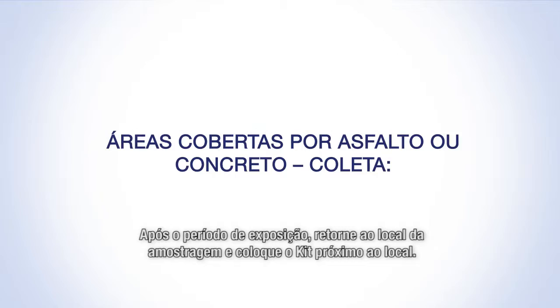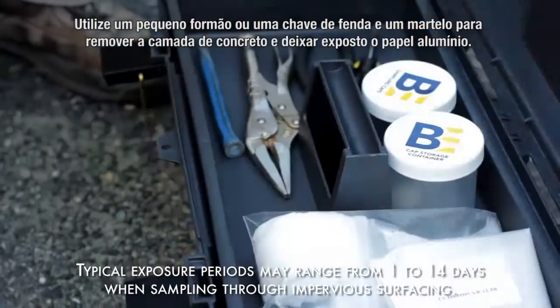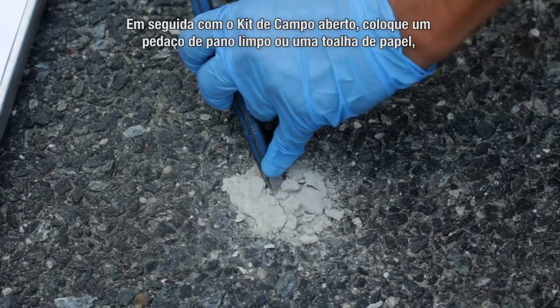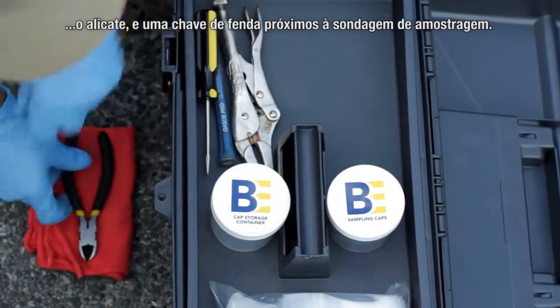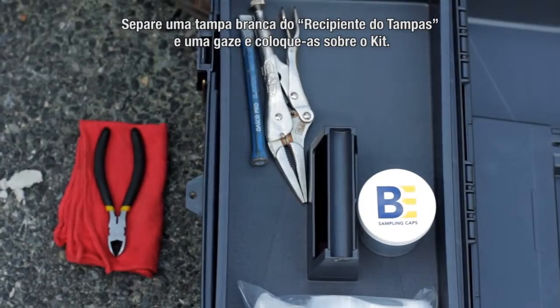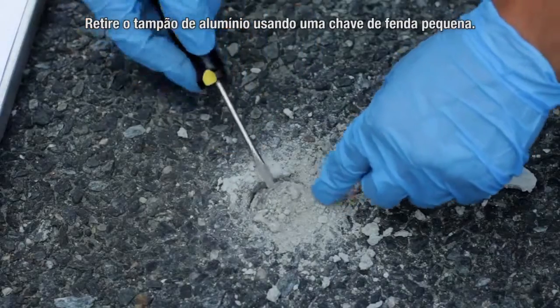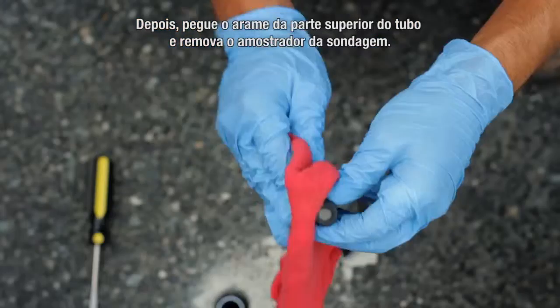Following the exposure period, return to the sample location and place the kit next to it. Use a small chisel or screwdriver and hammer to remove the concrete patch to expose the aluminum foil — the concrete patch is easily chipped out of the hole. Next, with the field kit open, place a clean cloth or paper towel, wire cutters, and screwdriver next to the sampling hole. Remove a solid shipping cap from the cap storage container and place it and a square of gauze cloth on the open kit. Remove the aluminum foil plug using the small screwdriver, then grab the wire hanging on the top of the pipe and remove the sampler from the hole.